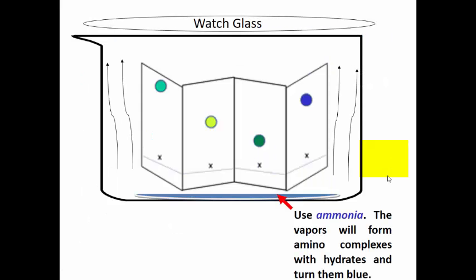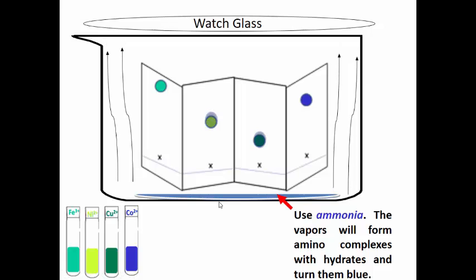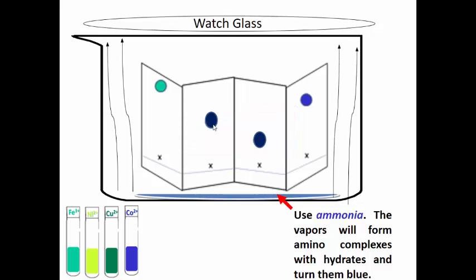We've already developed our plate, and now we've added ammonia to the developing chamber. Let's recall what our spots are: iron, nickel, copper, and cobalt. Now let's watch what happens as the ammonia vapors saturate the development chamber — you can see that two of the spots actually turn dark blue. Ammonia turns hydrates blue by ligand displacement: the ammonia kicks off water and replaces it, and those complexes show up as a navy or dark blue.